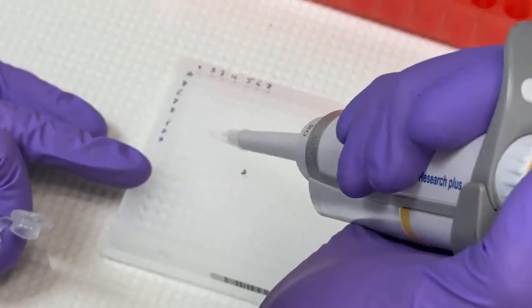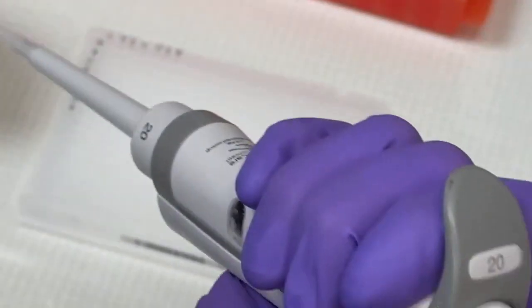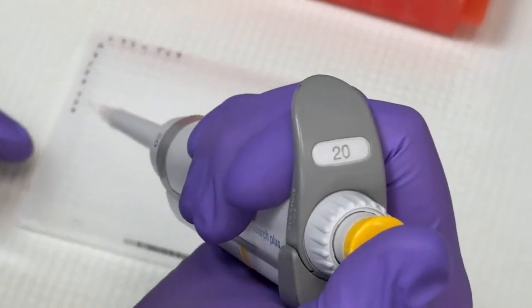If you're pipetting and your tip touches something, you lose track of where the tip is and you happen to touch it on something, go ahead and discard it and use another one. There's plenty more tips here, and it's not worth having to repeat a whole experiment to save the money on one little tip.